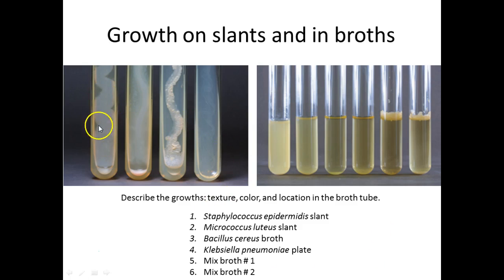So you can see these guys are kind of whitish, right? This one looks how? It's kind of chunky looking, huh? Whitish, kind of chunky looking. And this one, y'all, believe it or not, there's bacteria on there. They're translucent. So you might get an organism, or we might work with an organism and be like, Miss Acker, you gave me an empty tube. I said, no, look closely. Right? They're translucent. It's kind of hard to see them, but there's growth on that slant. Trust me. There are bacteria there.